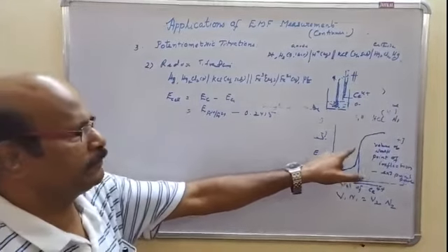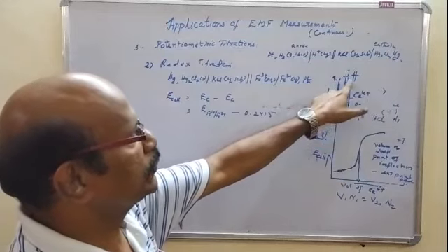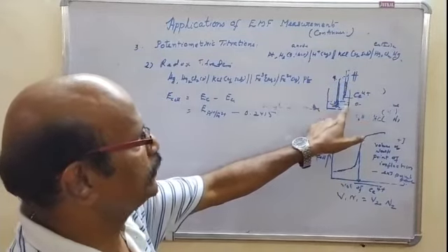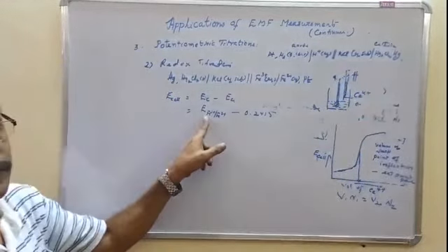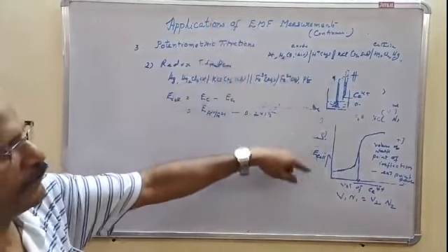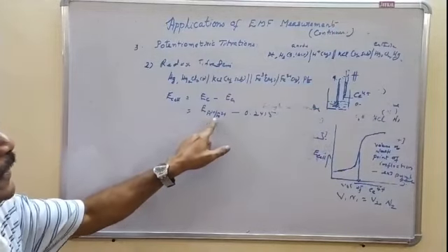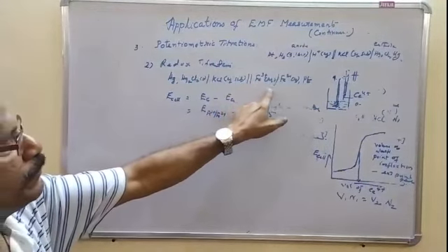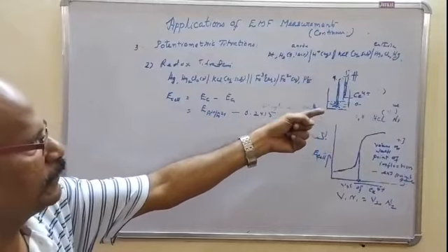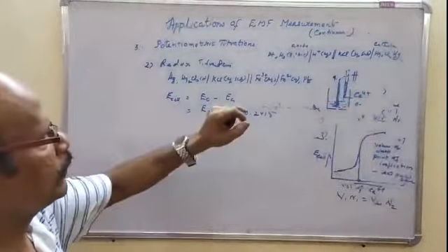As the titration progresses, on the addition of ceric sulfate, this potential goes on increasing while the calomel potential remains constant, so the EMF of the cell increases, because Ce4+ converts more ferrous into ferric.